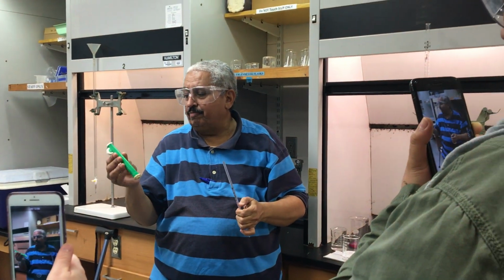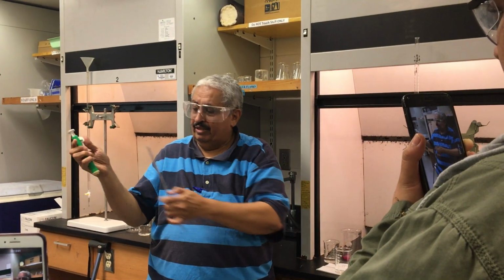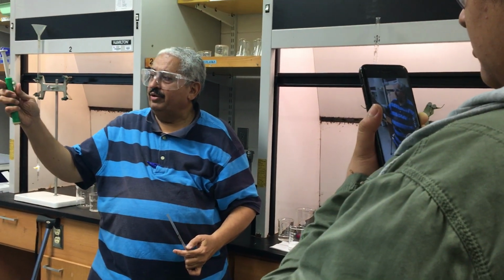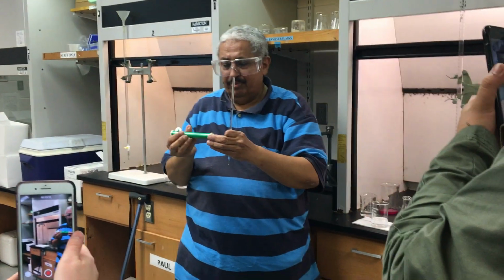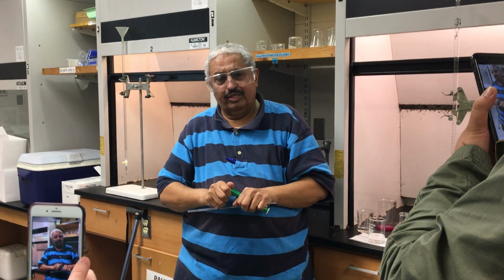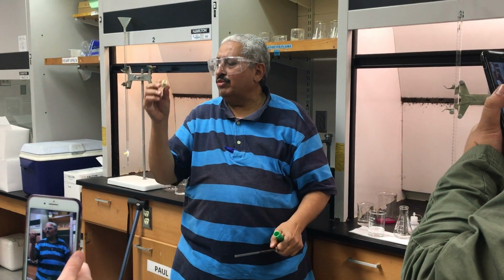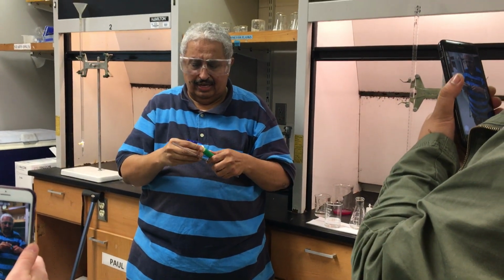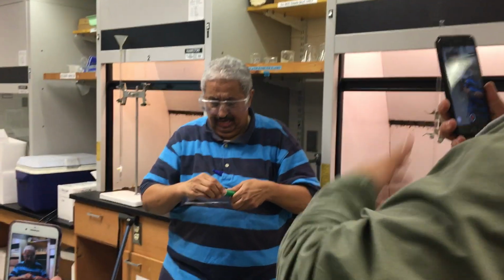This is called the pipette adapter, and it has a wheel going up, which creates a vacuum that sucks the whole thing up. When you want to release it, you just turn the wheel down, so that will bring the whole thing out. Sometimes, if the adapter is not working, there will be a hole inside the adapter mouth, which is plastic here. If it's not working, then it has a leak here, so there is no vacuum created. So we'll hope it will work very well. If it's not, then we'll replace it.